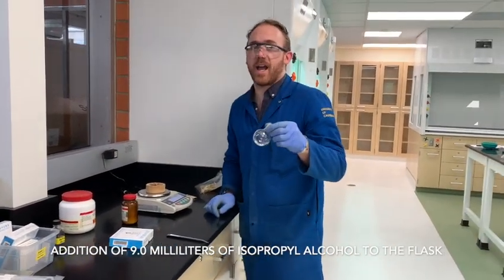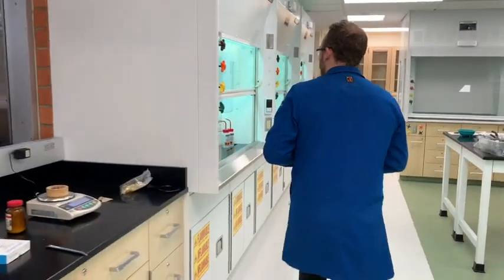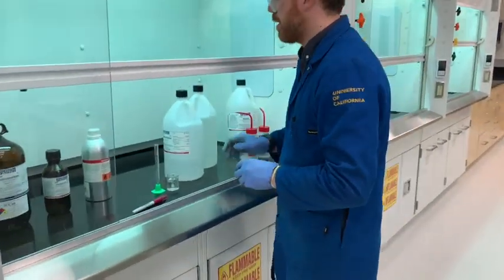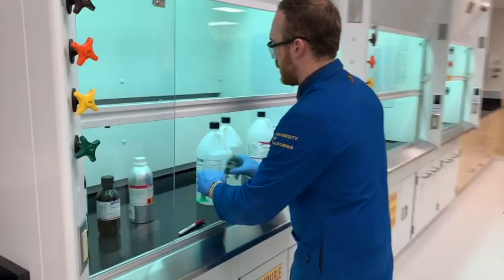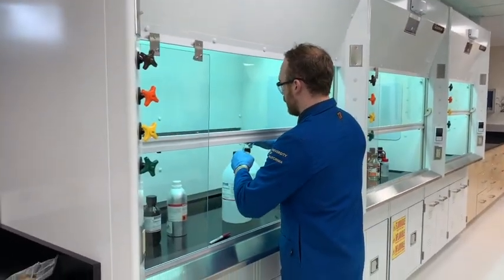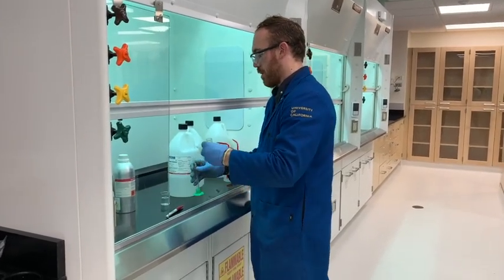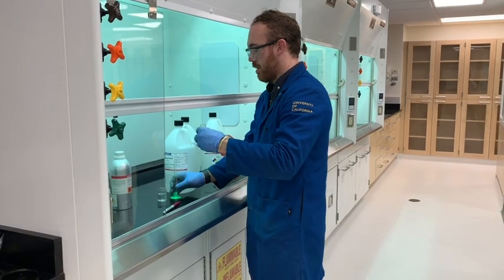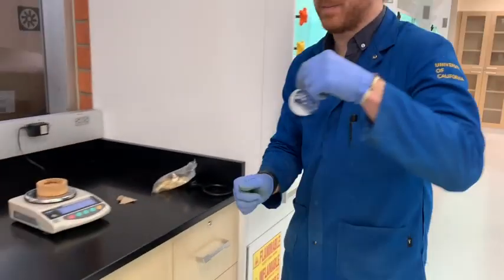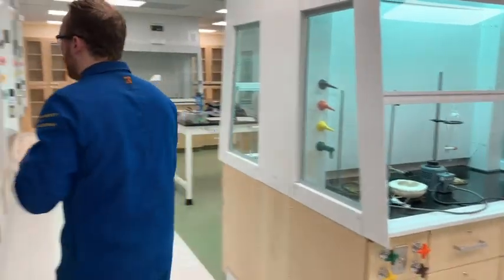So next, we're going to take this and add 9 milliliters of isopropyl alcohol, which I already poured into a smaller container. I'm going to try to do this with some finesse working inside the hood. We're just going to let the slurry sort of mix together, and I'm going to leave this over in the hood until I need it.